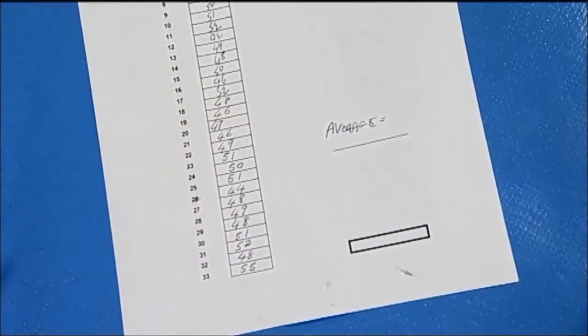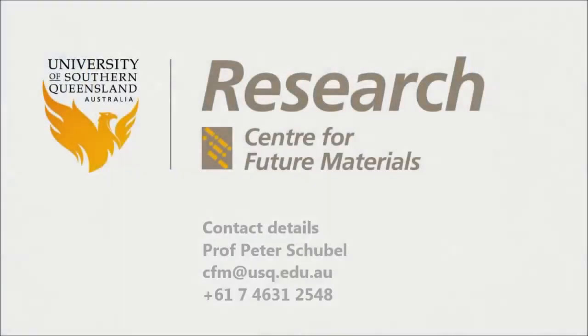From 33 readings, the average is recorded as the Barcol Hardness.